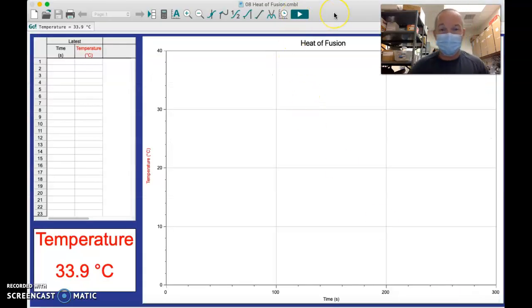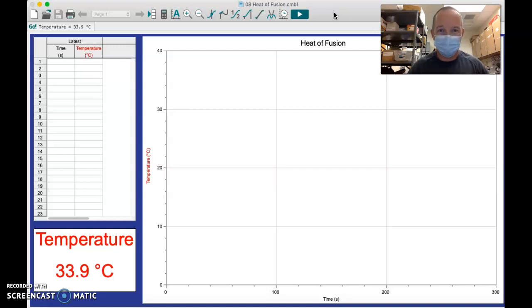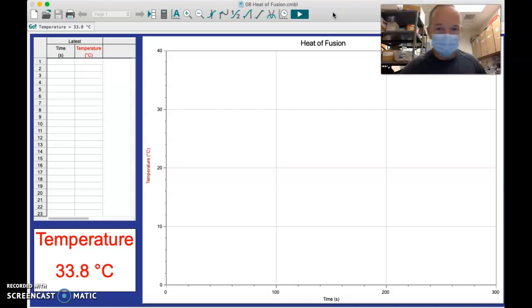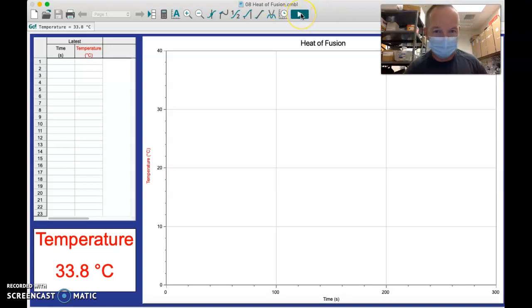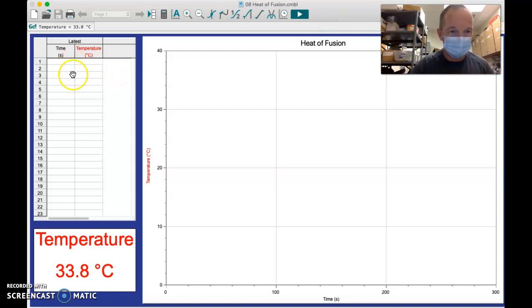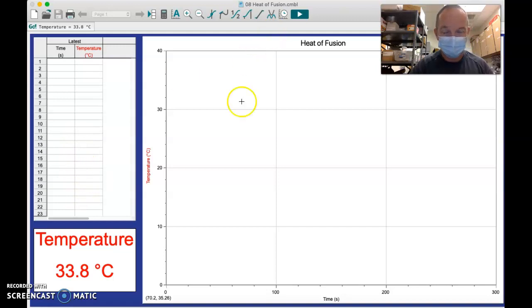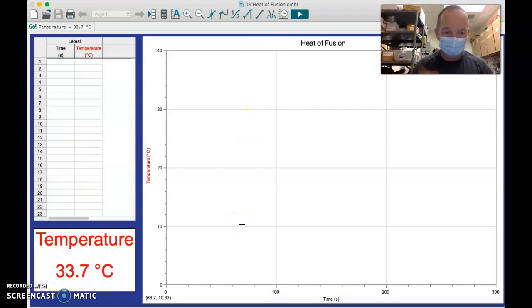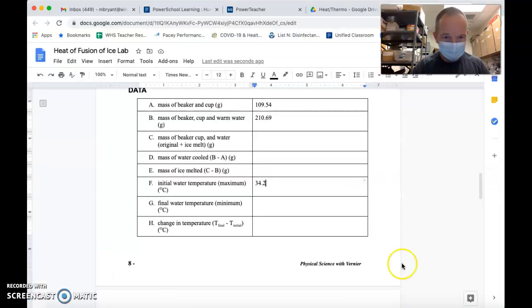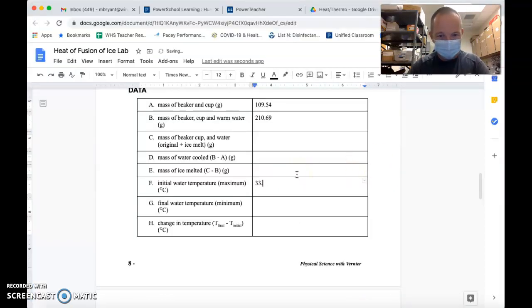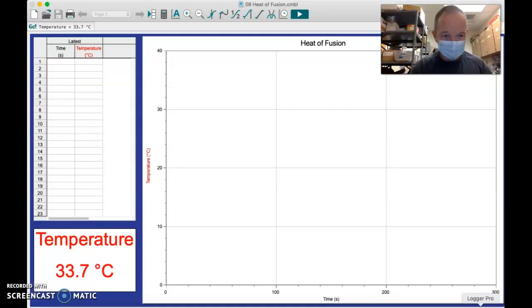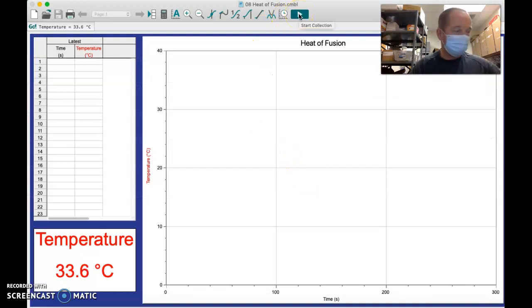I'm going to go back to Logger Pro. I've opened up a specific template for this lab, so this is going to show us exactly the data we need to see. What I'll do is start recording the temperature by hitting this green play button. Numbers are going to start showing up fast and furious down here on the left, and it's going to start graphing the temperature as we go. It looks like maybe I need to amend this temperature a little bit because it's gotten a little cooler since we started, which is to be expected.